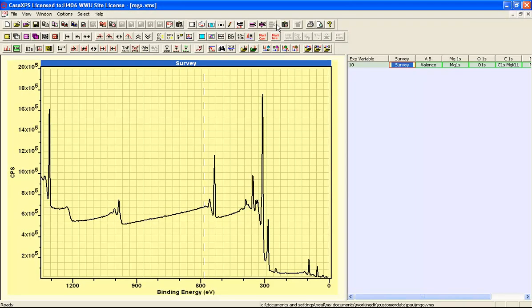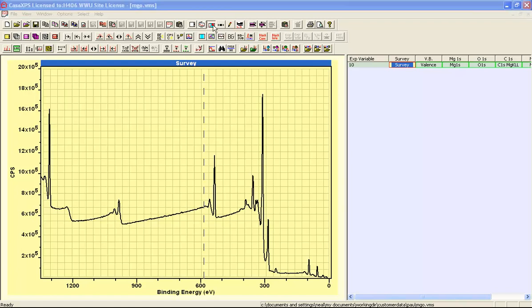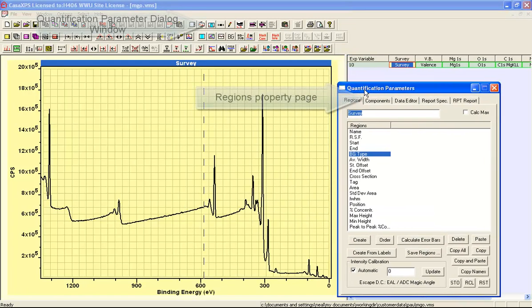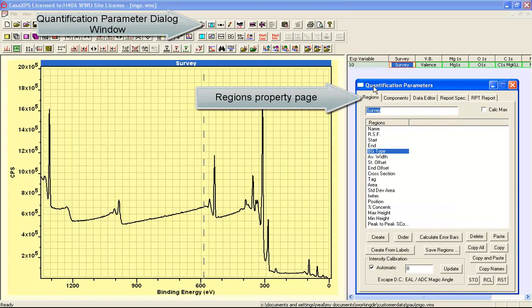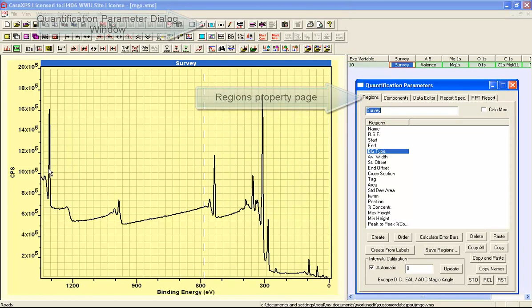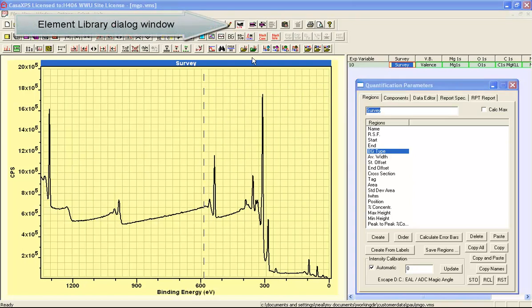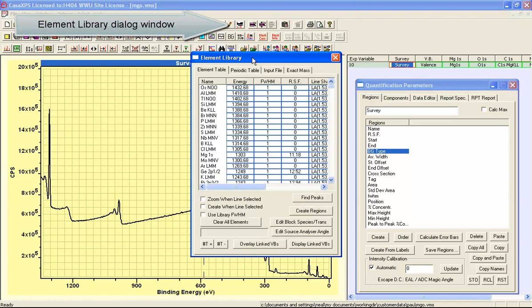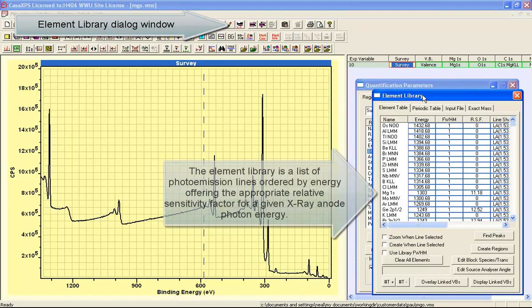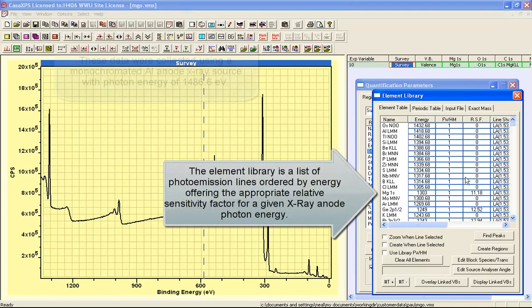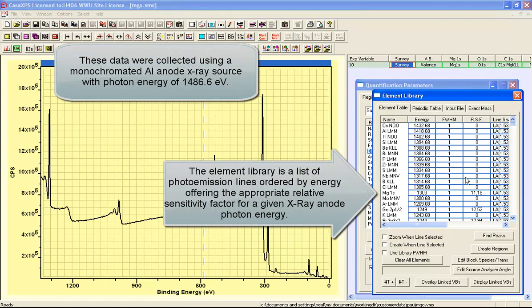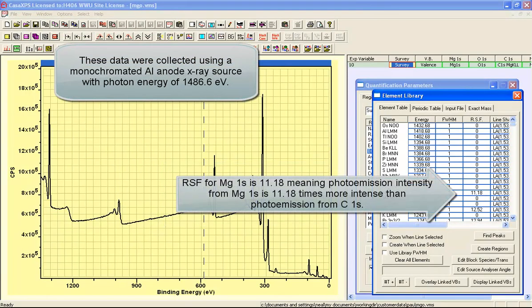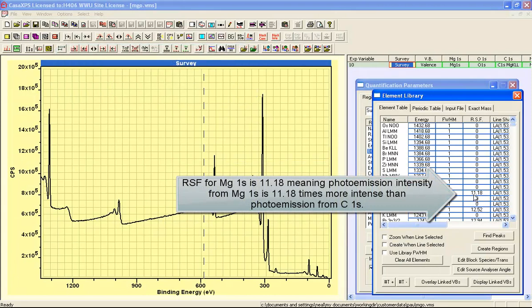We will now implement on these magnesium oxide data the quantification steps. And the first thing we will do is create regions that will define the relative sensitivity factors for these peaks. So we will use the element library. The element library includes a list of photoemission lines and the relative sensitivity factors, for example this magnesium 1s is 11.18.